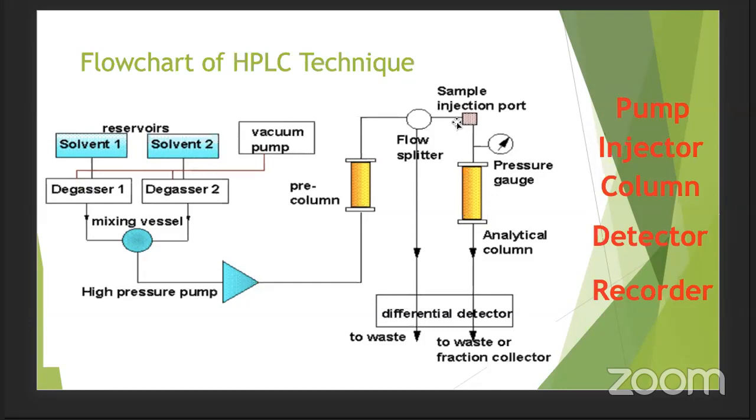This micro volume sampling injector also has the capability of auto injecting. So you can program it and auto inject multiple analytes.